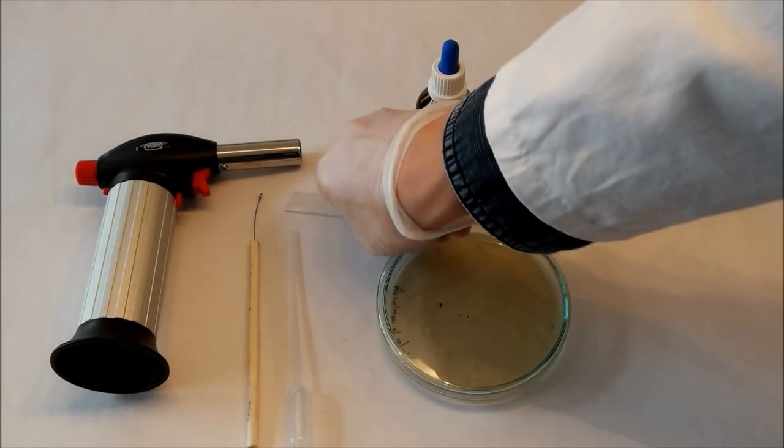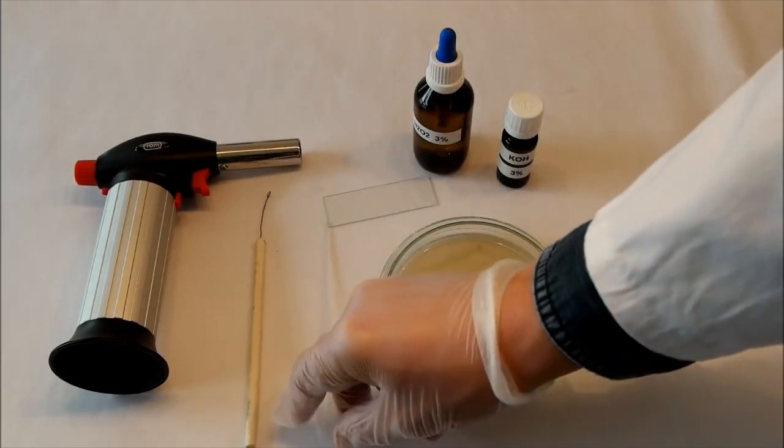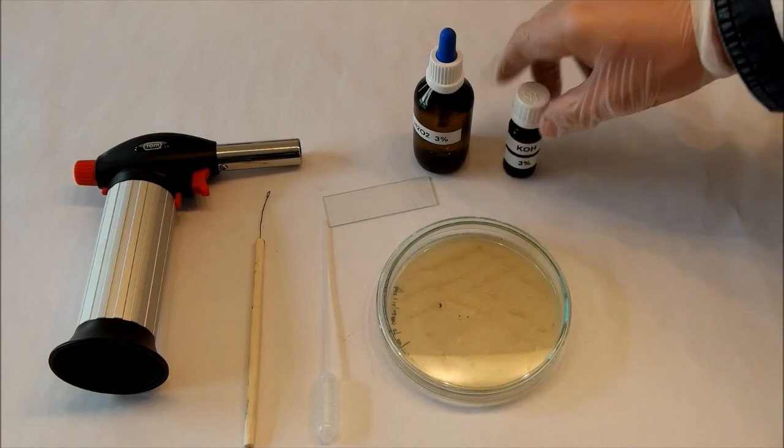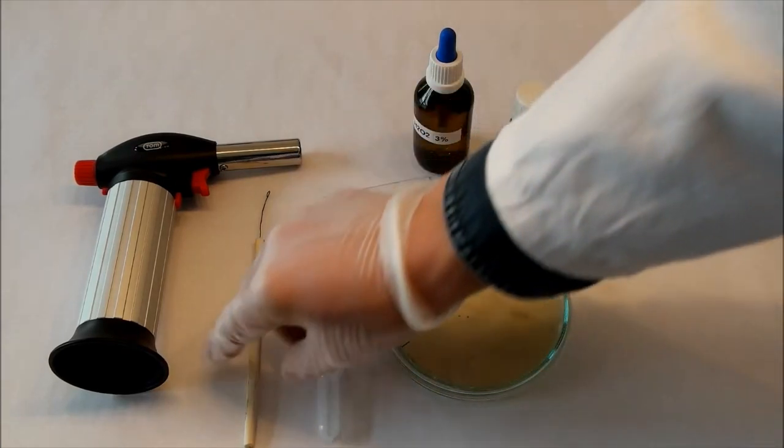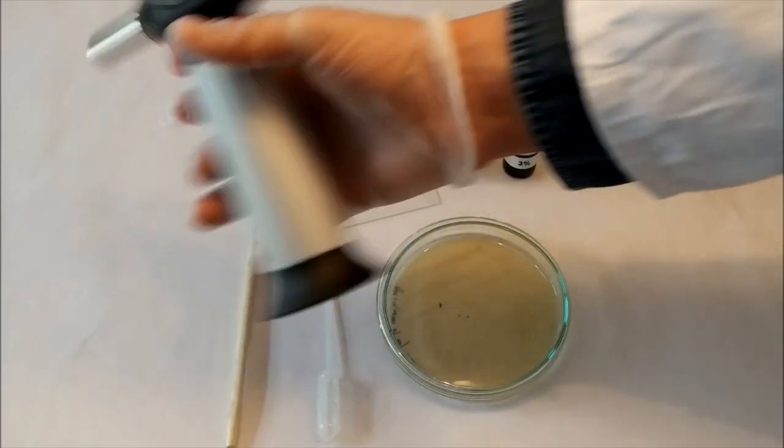Furthermore you need a glass slide, like for microscopes, then a pipette to drop the potassium hydroxide later, and an inoculation loop, and to sterilize it, a little Bunsen burner, like this one.